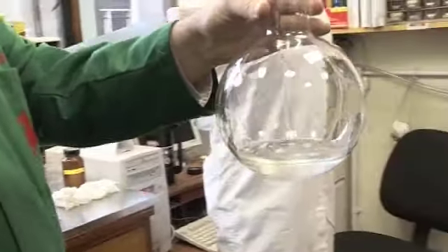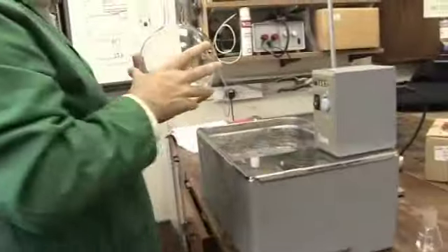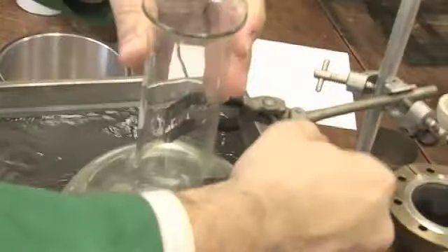And now warm the solution to about 70 degrees. We're going to do that using the water bath. So there's our sugar and our silvering solution. And we'll leave that a few moments and we'll come back and see what happens.